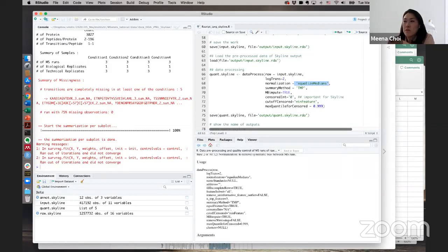So what is the difference between the biological protein level and the technical replicate protein summarization? For the data processing step, we do not distinguish biological replicate and technical replicate. We are only focused on run and feature. Whether it is group, biological replicate, or technical replicate doesn't matter at all. So for the data processing step, we report the run-level protein summarizations.